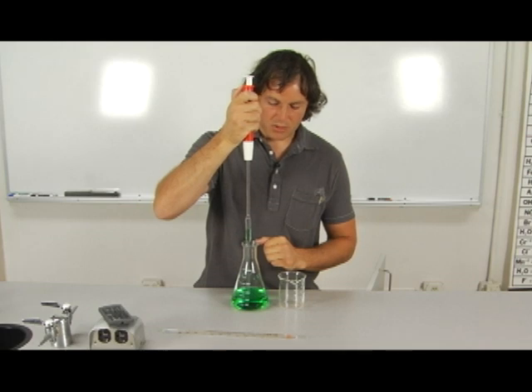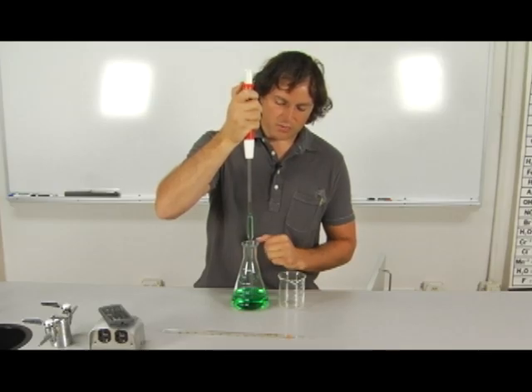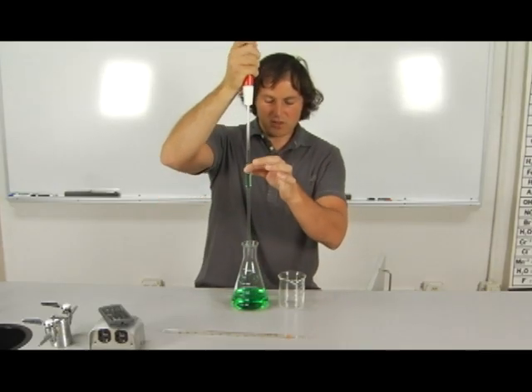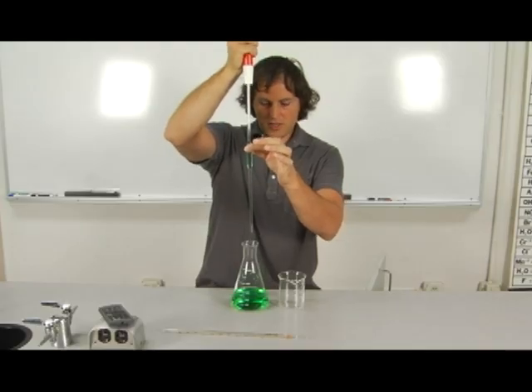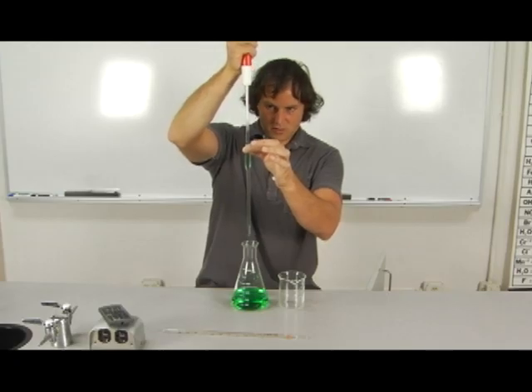So the volume is going up the bulb and then I get to the top of that and slowly I reach up. This volume can fall as we pull out of our fluid and again we're reading this as a meniscus just as a volumetric flask. So I can drain out just a little bit using my thumb valve and now the bottom of the meniscus is on that line.